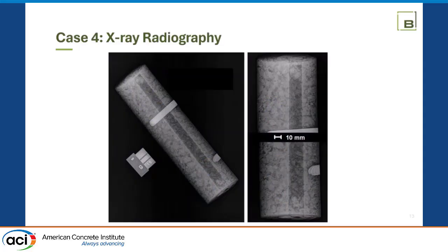So I also played a little bit recently with X-ray radiography, just like when you break your bone and go take a scan. In this particular case, it was a foundation that had a pipe in it, and it was supposed to be grouted. And they were having multiple instances of water intrusion on these sections. They extracted cores out of it, and what you can see in the radiography is the steel right there, very bright on the left, two orientations, and then a hollow area in between, or a change in density in between.